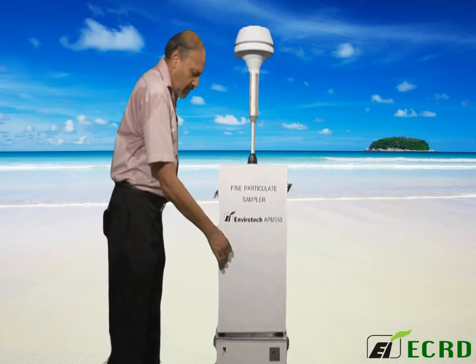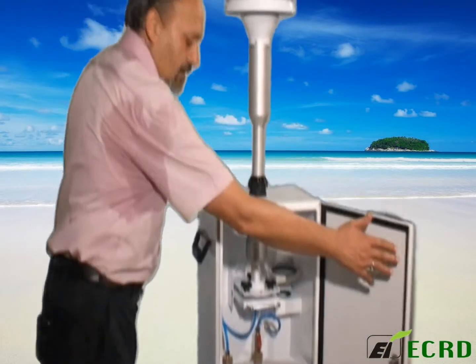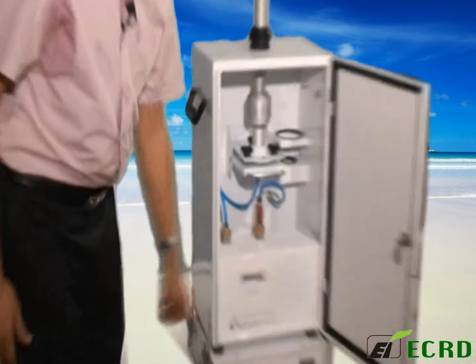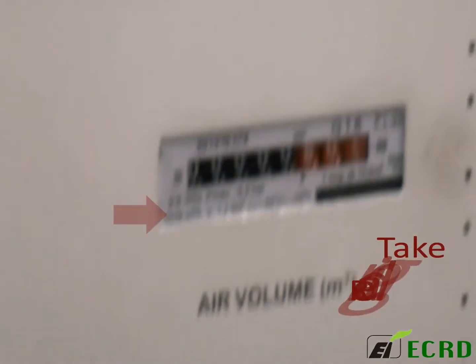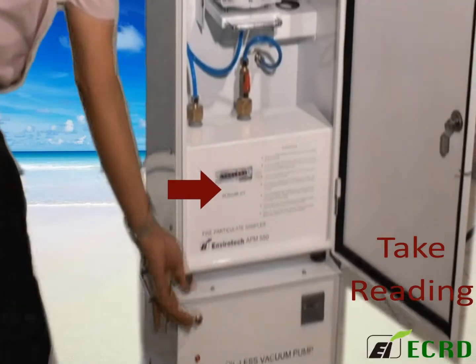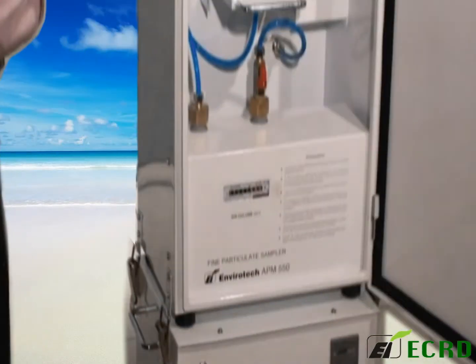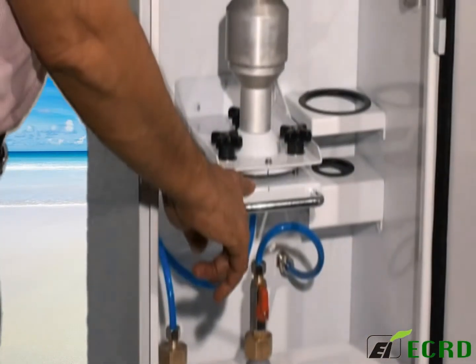The pump is on. You open the cabinet — dry gas meter reading is in progress. You will switch off the instrument, note down this reading, and now you have to retrieve the sample.